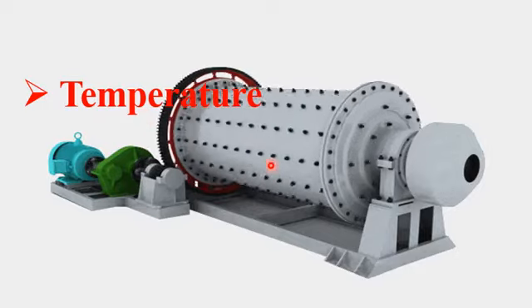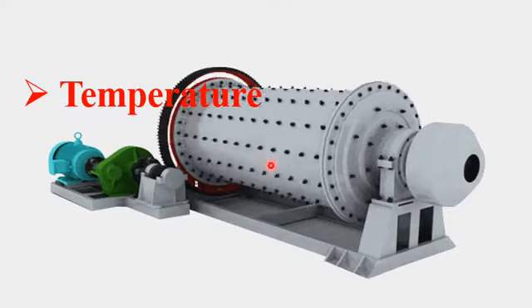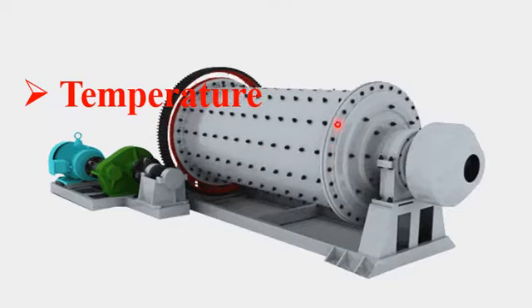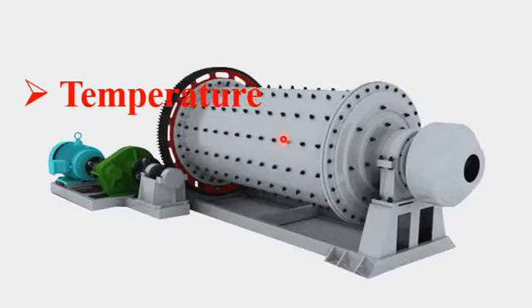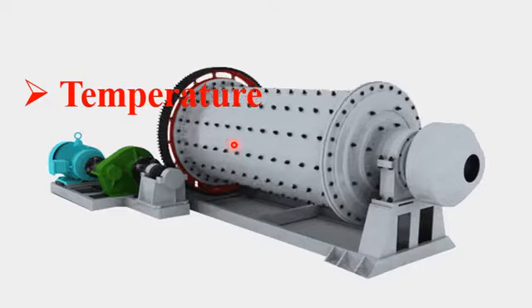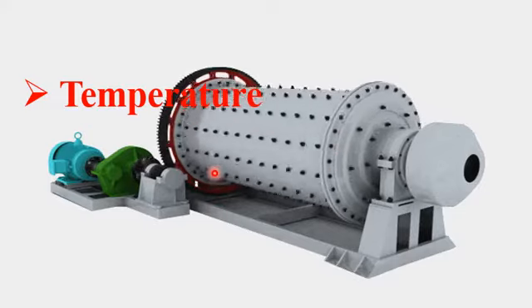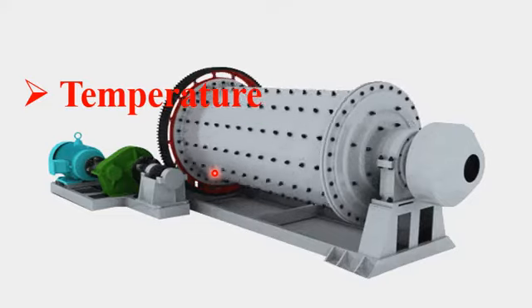Okay, please note that if the frequency inside the ball mill apparatus is high, there will be more collision of the balls with the bulk material, which will result in a higher temperature inside the ball mill operator. Please note that this temperature inside the ball mill has pros and cons. It has advantages and also disadvantages.